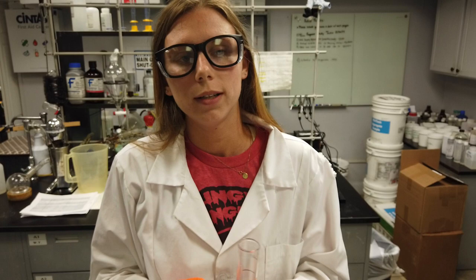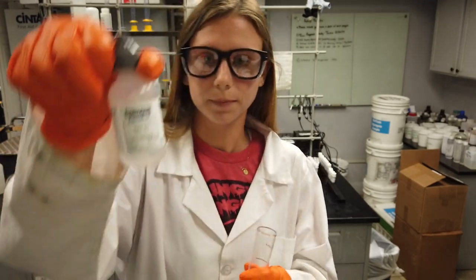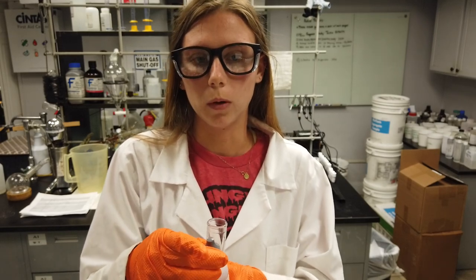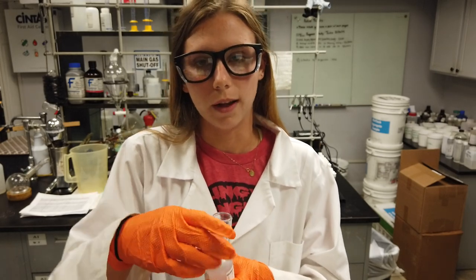You will titrate with QACDT drop wise while swirling. Count the number of drops until the sample color changes from blue to purple/pink. You should expect about 9 to 11 drops.